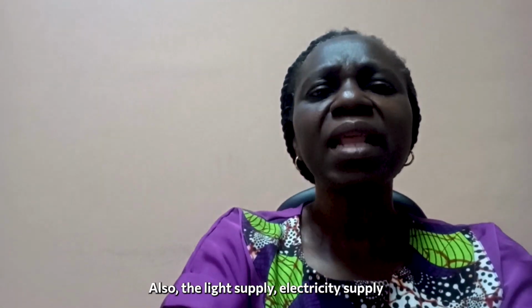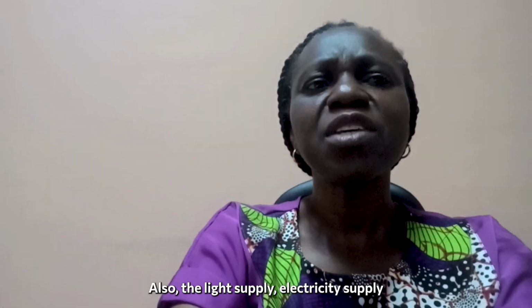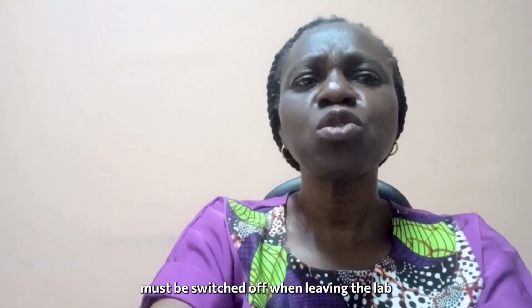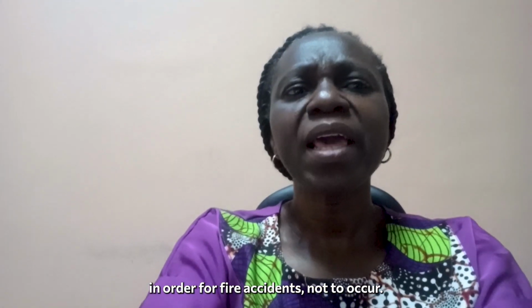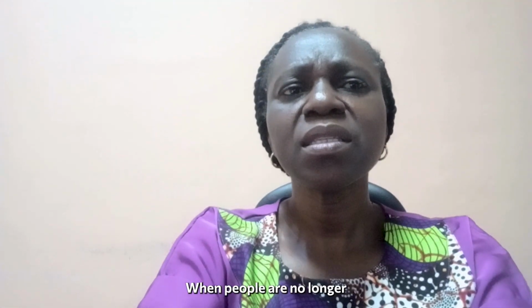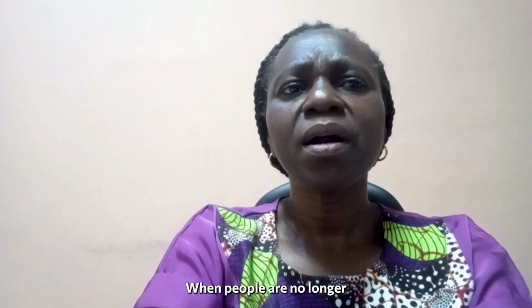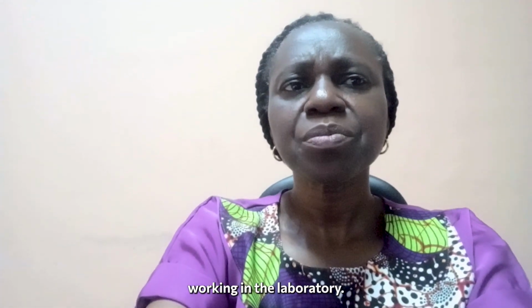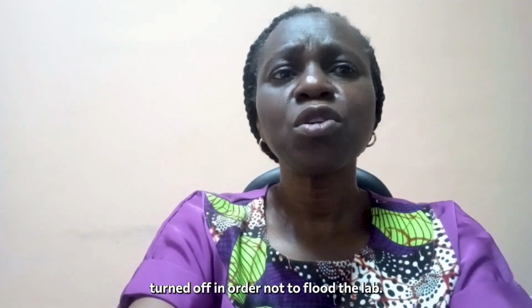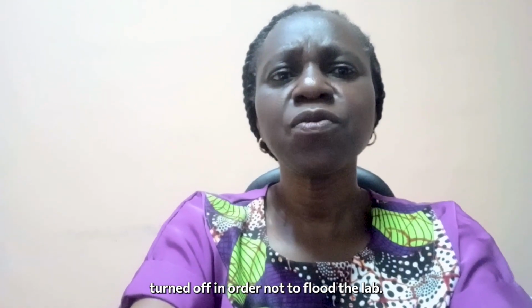Also, the light and electricity supply must be switched off when leaving the lab in order for fire accidents not to occur when people are no longer working in the laboratory. Also, the water supply must be turned off in order not to flood the lab.